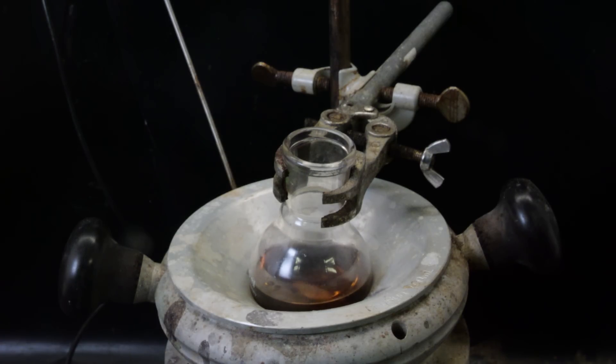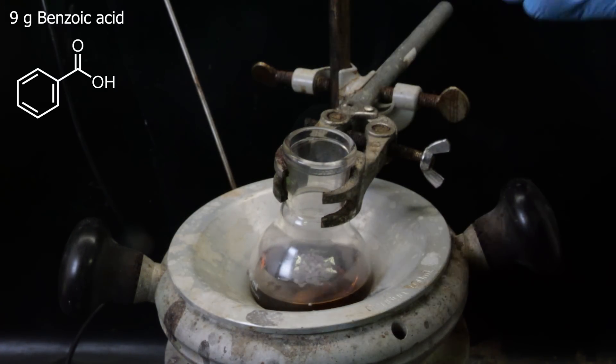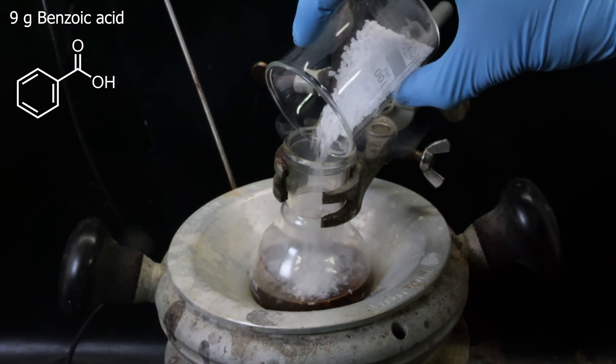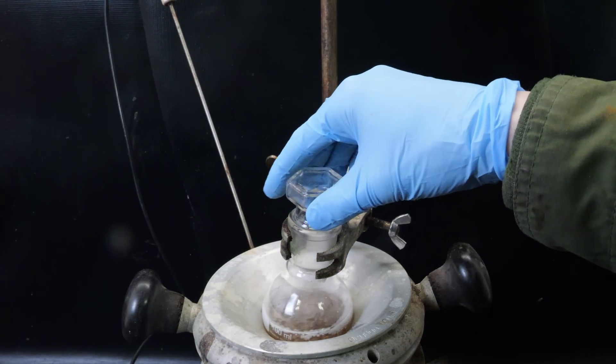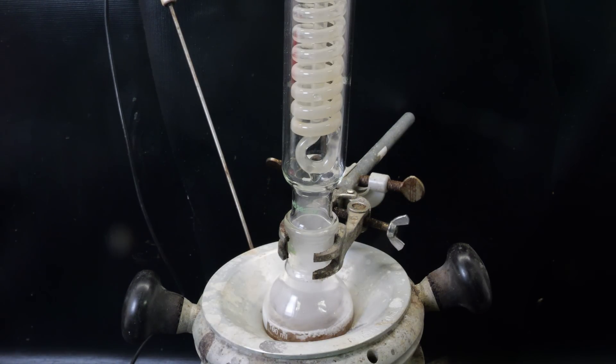So I set the flask in heating mantle, and I add 9 grams of benzoic acid into it. I heat it to 120C and wait for it to dissolve. I added a condenser without water flow and a gas adapter on top to keep out most of the moisture.